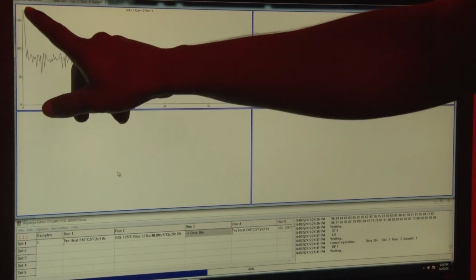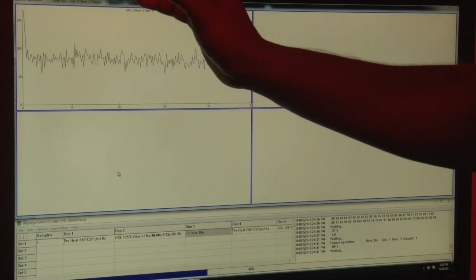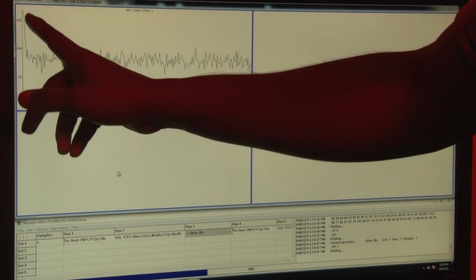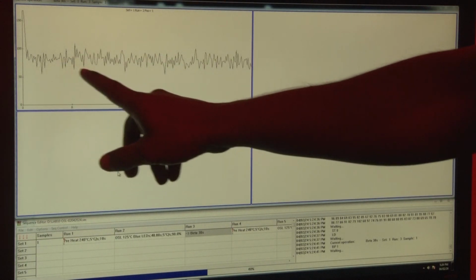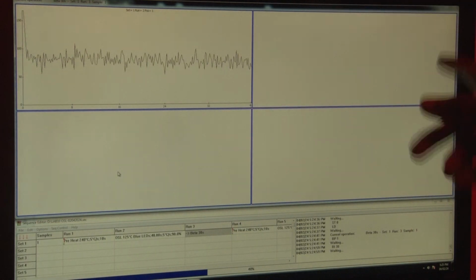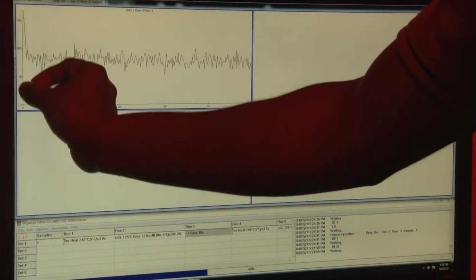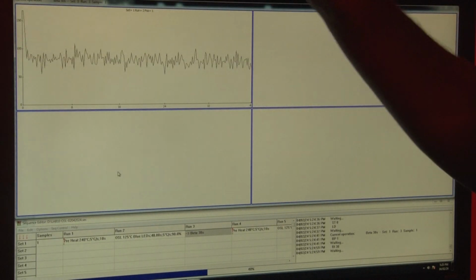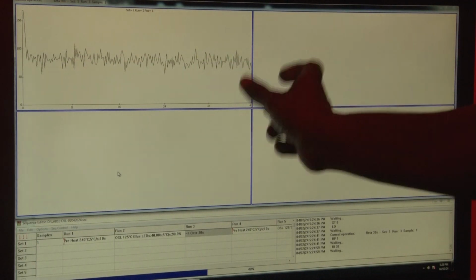For the age estimation, we are basically considering the photon count for the initial 0.8 second. And this is the background part, which we have to subtract from the sample. So you have to take the integration of the initial 0.8 second data, the photons, and subtract the last 4 seconds.